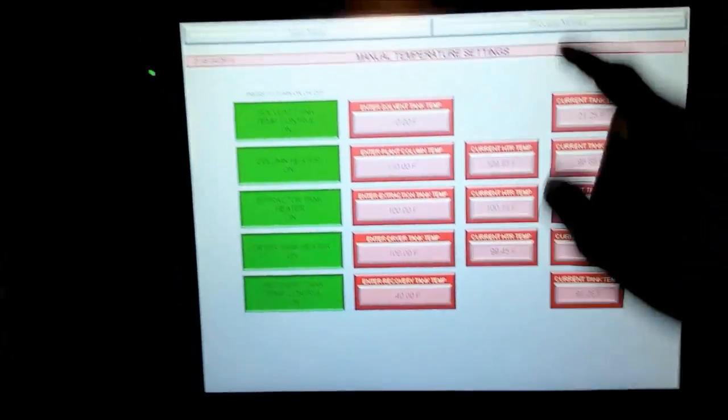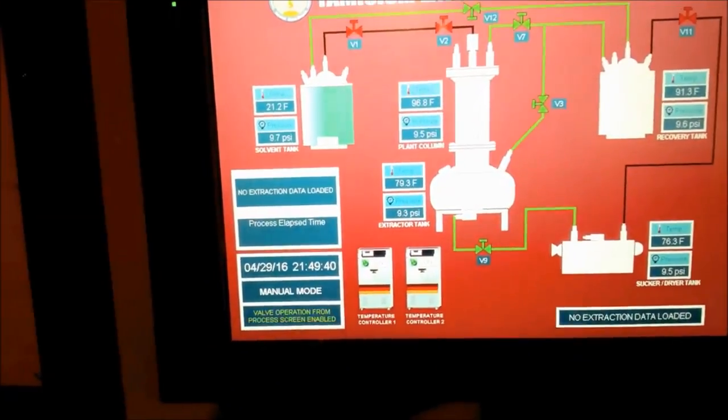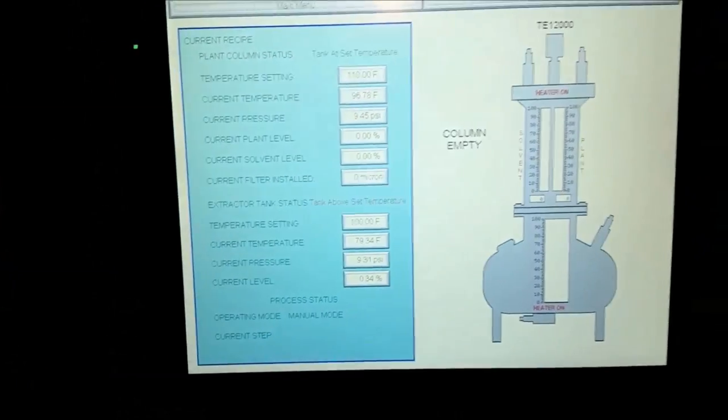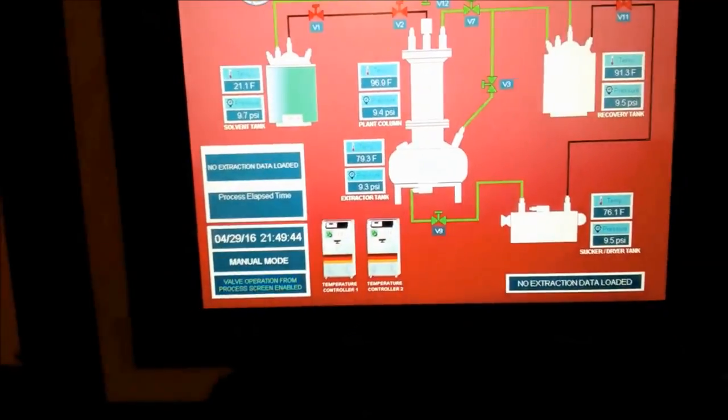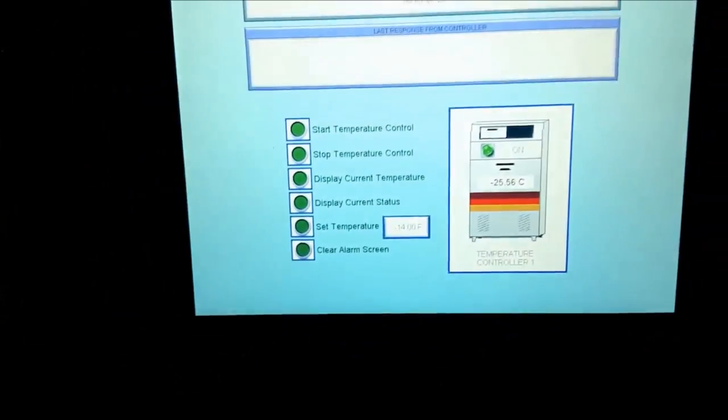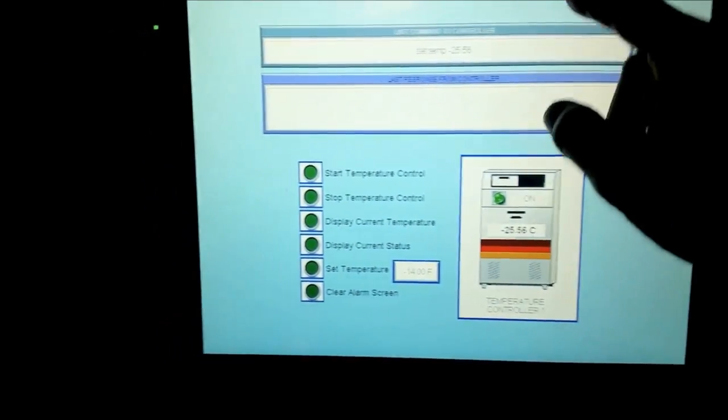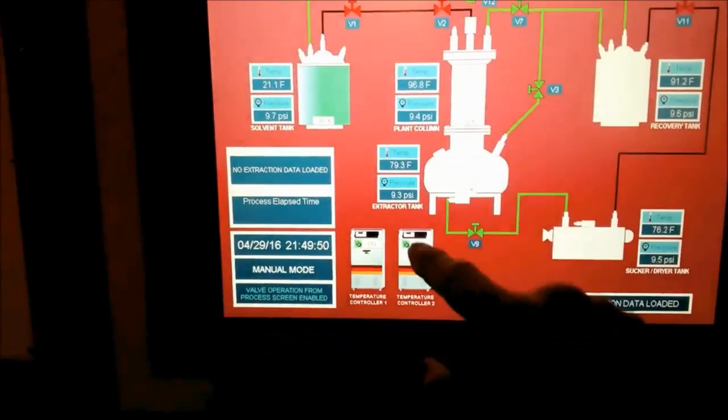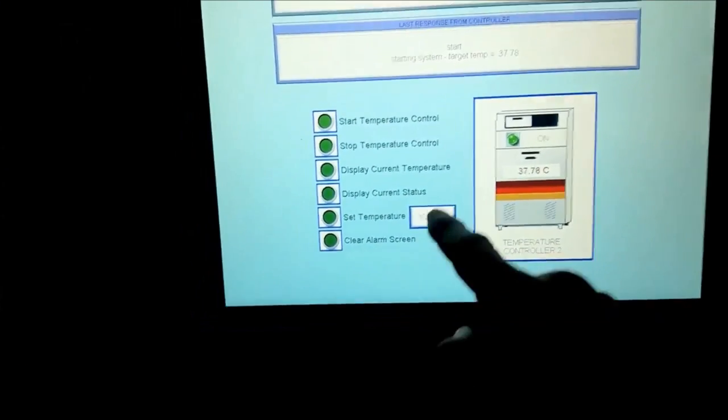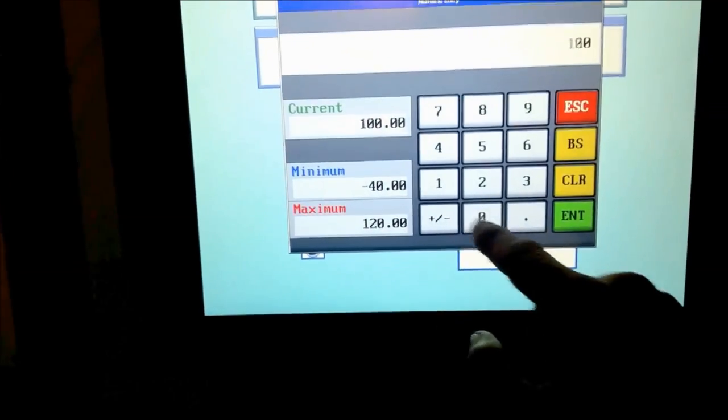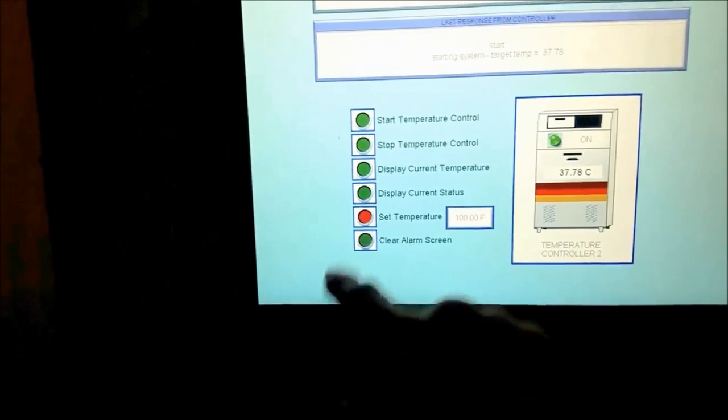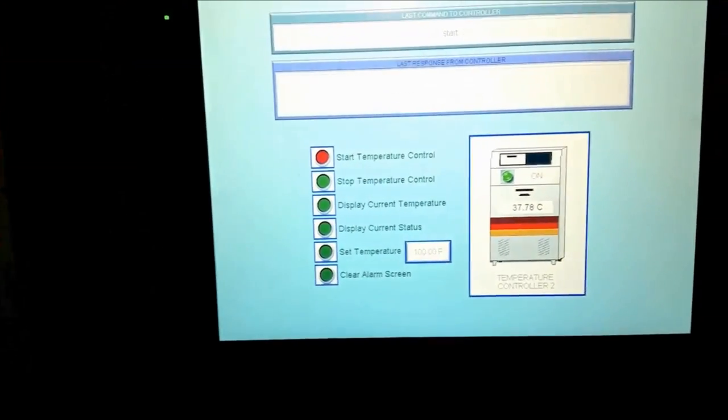Go on to the temperature settings, go on to the properties of each tank, go into the chiller for each chiller. You can set its temperature, you know, set the temperature, start temperature control.